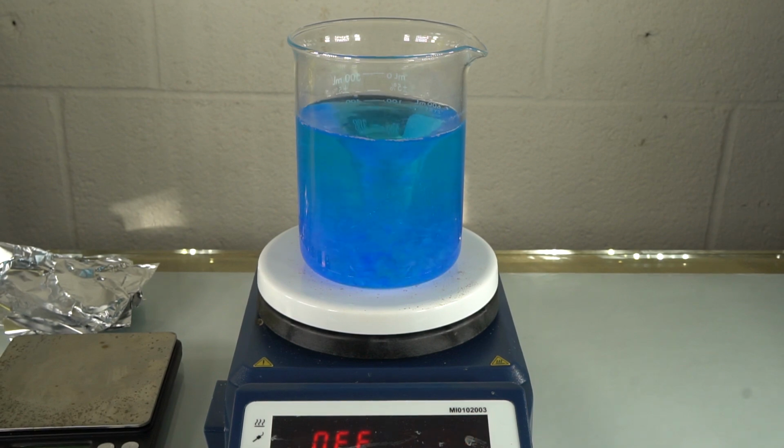And by the way, the copper powder that we make today is going to be used in a wide variety of future experiments. We can react it with hydrochloric acid and acetic acid to make copper compounds. Those experiments will need a little bit of help from hydrogen peroxide to get them going, but there are some really great experiments that we're going to do with this. Now, this is going to take a few more minutes. I want to stir this to get it all dissolved. So I'm just going to jump ahead, and then we'll have a nice finished, all dissolved solution of copper sulfate.